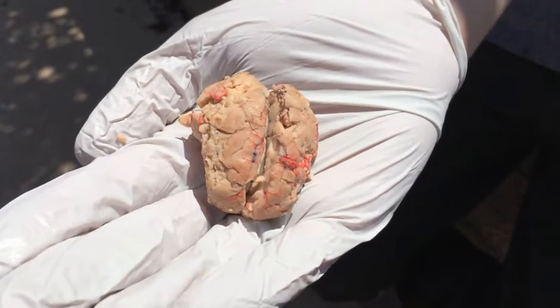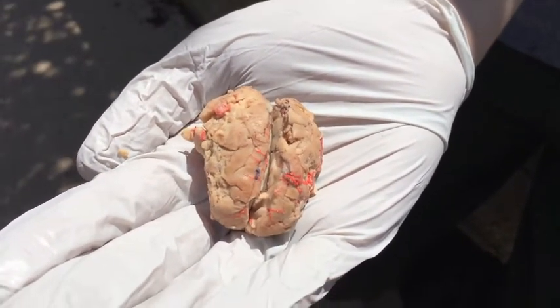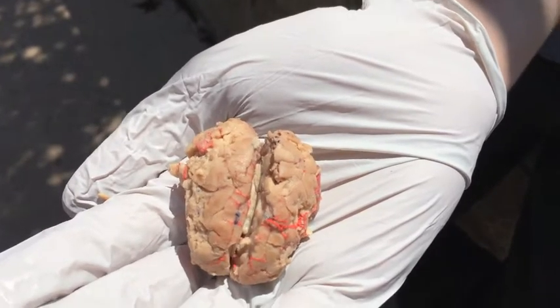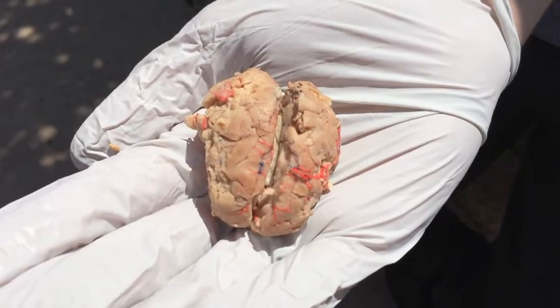Next we have the temporal lobe, which is on either side of the pig's brain, and that lies inferior to the frontal lobe and parietal lobe, and is separated from them by the lateral sulcus. And basically what that is responsible for is understanding and reading and speech.